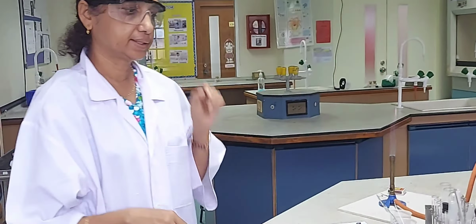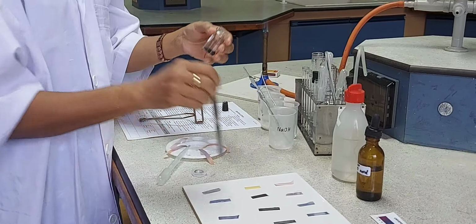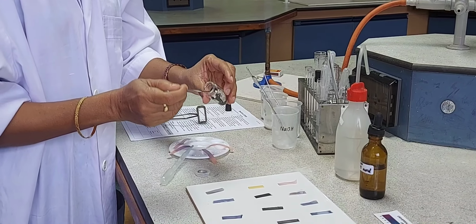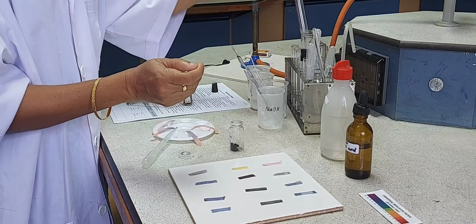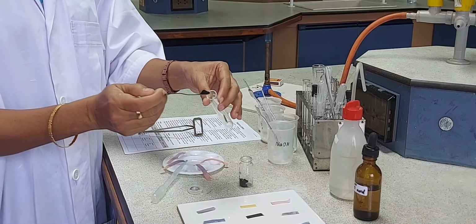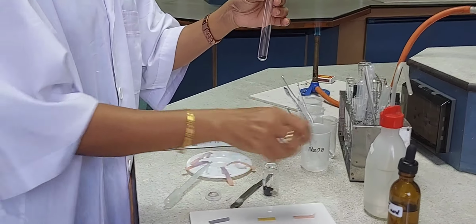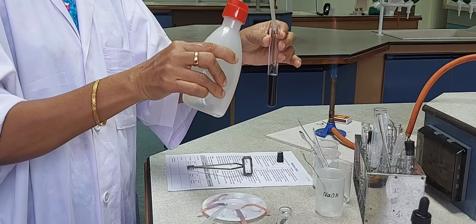So the last base that we will be investigating is copper(II) oxide, which is a black solid, and copper metal is in the transition period in the periodic table. So I take a small spatula of the copper oxide in a test tube, and add water to check its solubility, and I get a black solution.